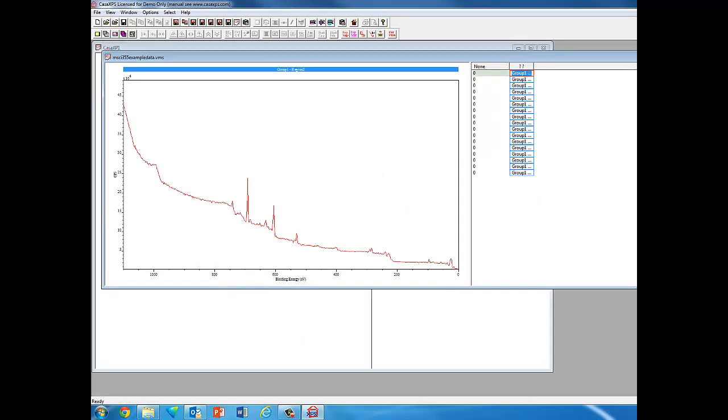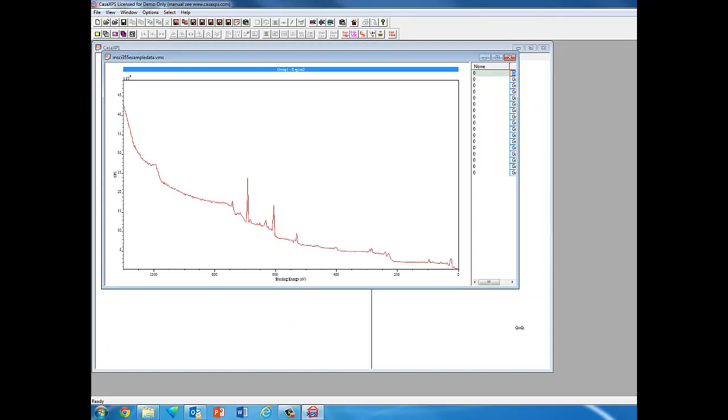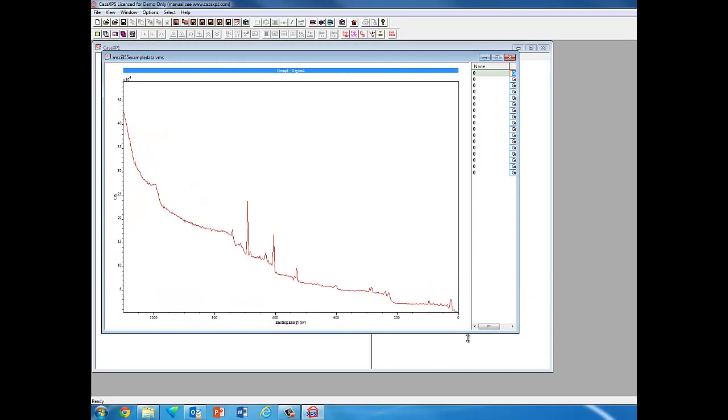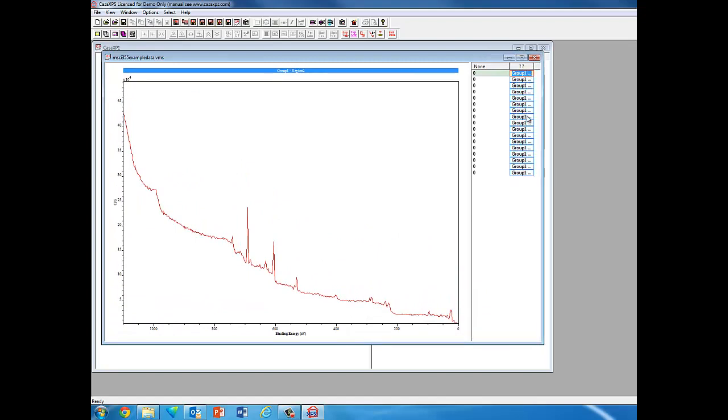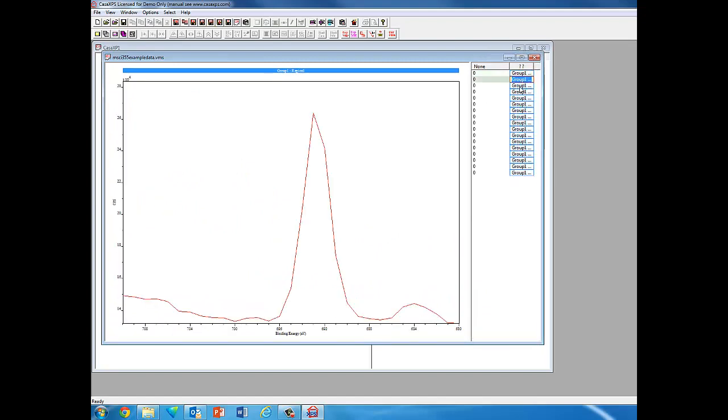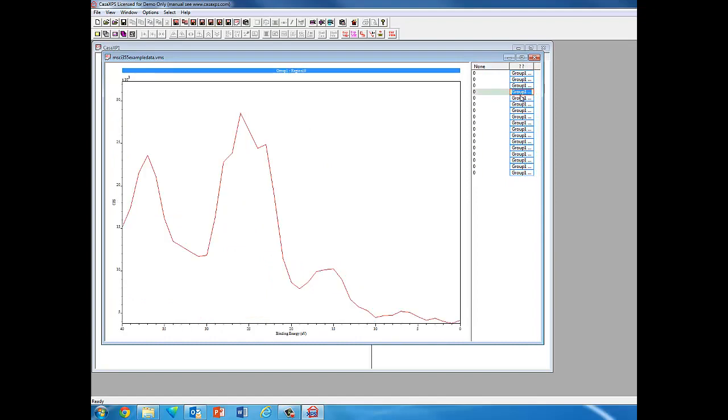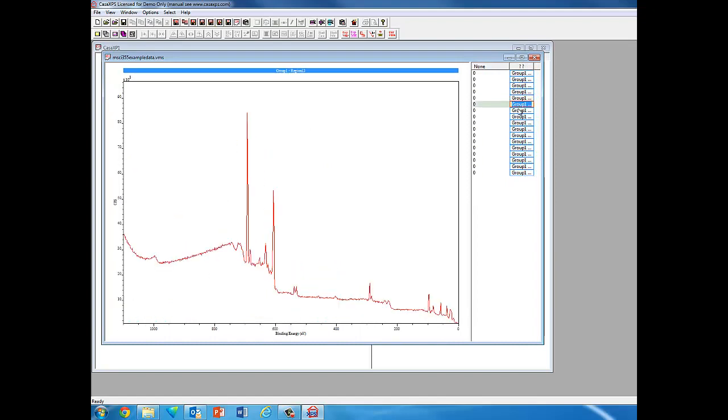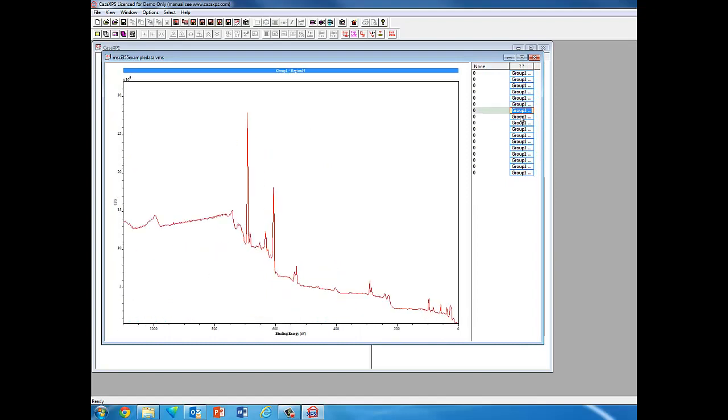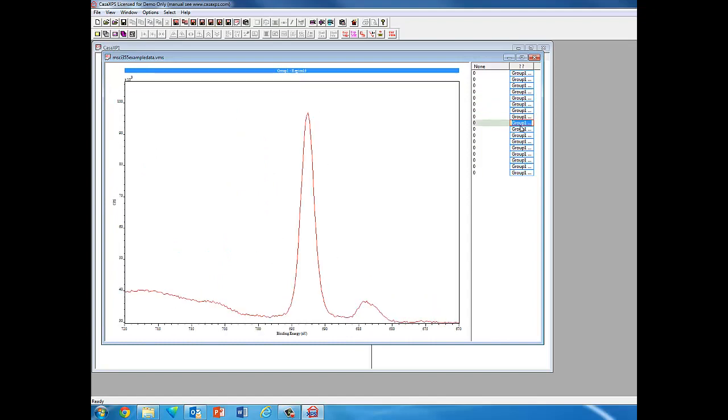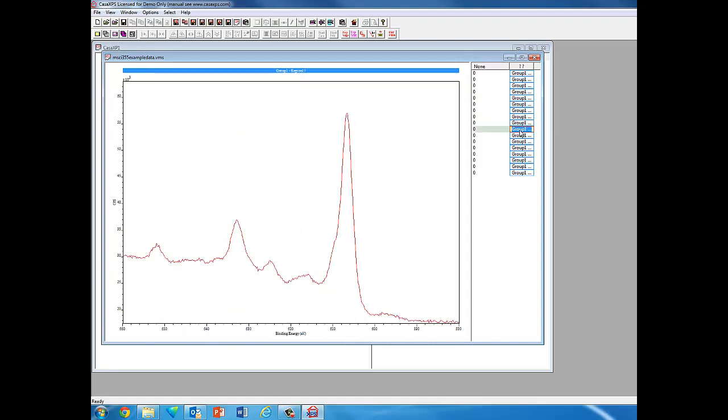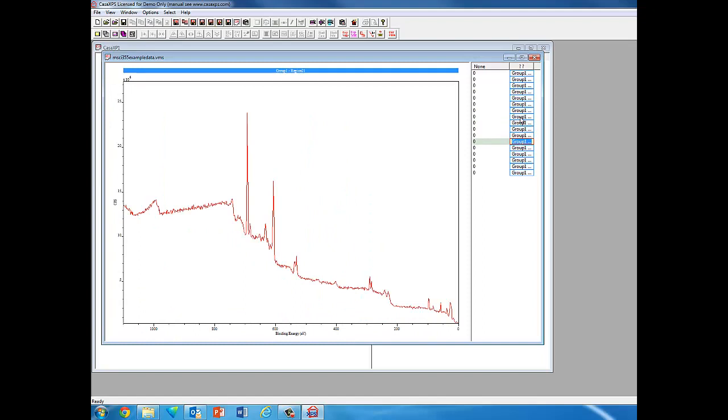Let me shrink this down a little bit. The data looks like that, and if we look at the groups we can see the different regions that were selected using the XPS. As I double-click down here we're seeing the different regions, some are narrow scans, some are wide scans.